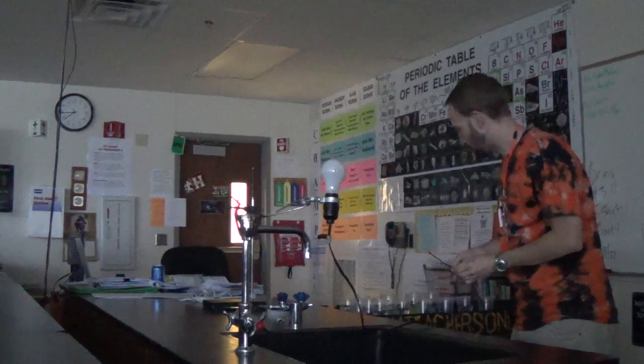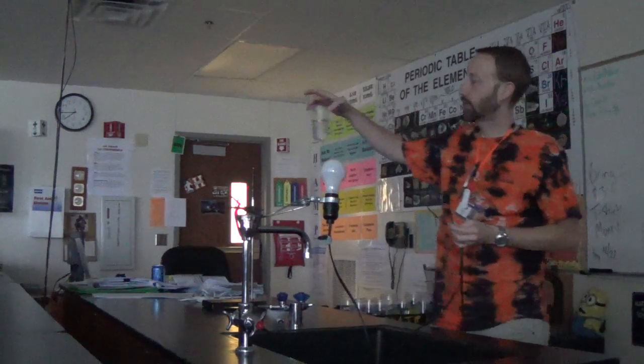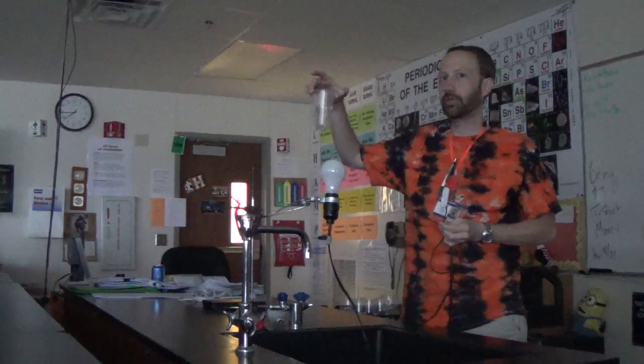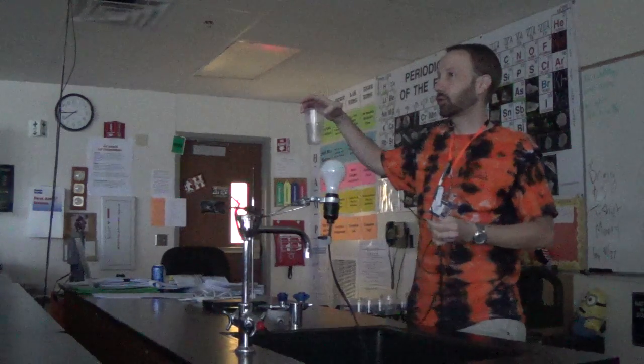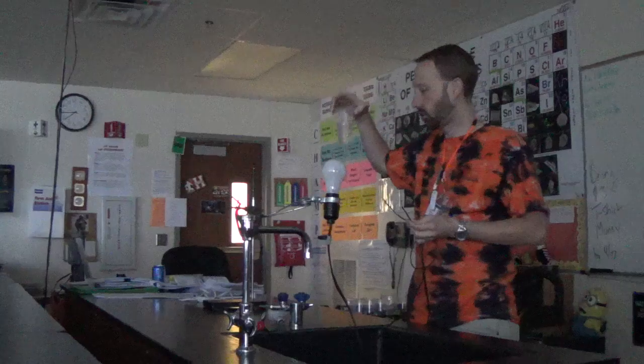Okay, what do we have next? Hydrochloric acid. It's so magical. Dump it on. For anything to be an acid or a base, it must be dissolved in water. That is one of those criteria to claim that something's an acid or a base. So now that it is dissolved, the question is how well does hydrochloric acid ionize?